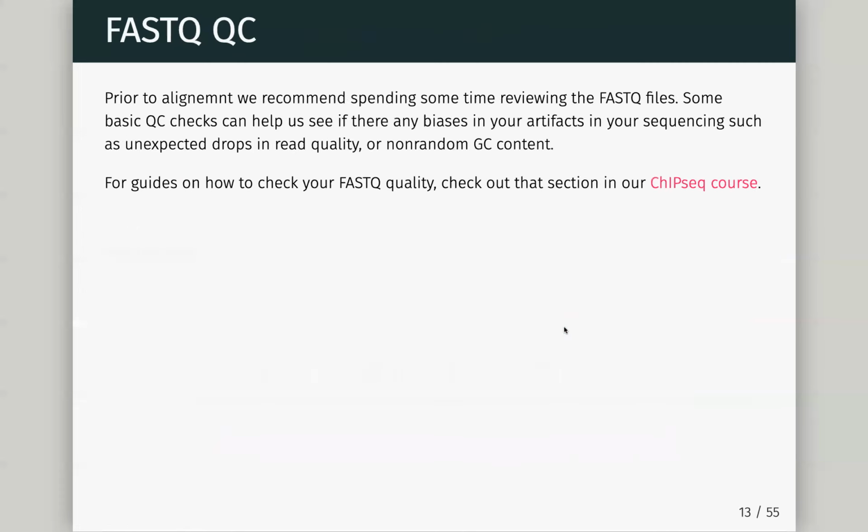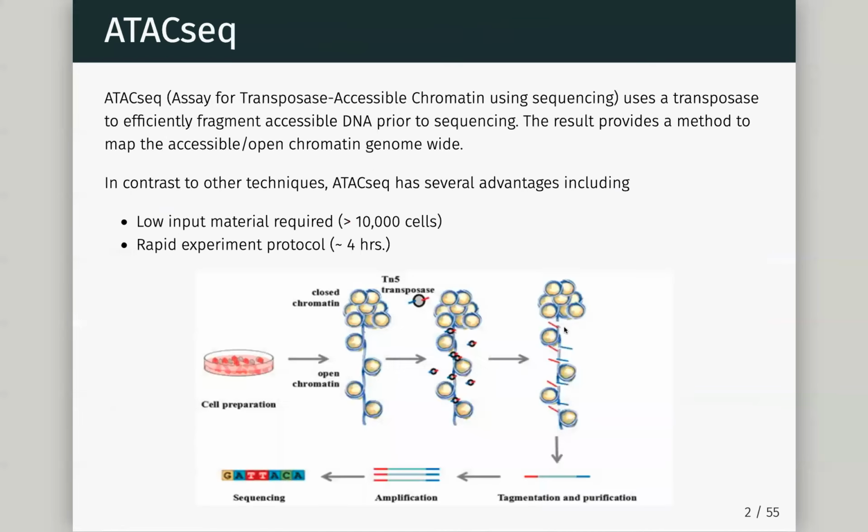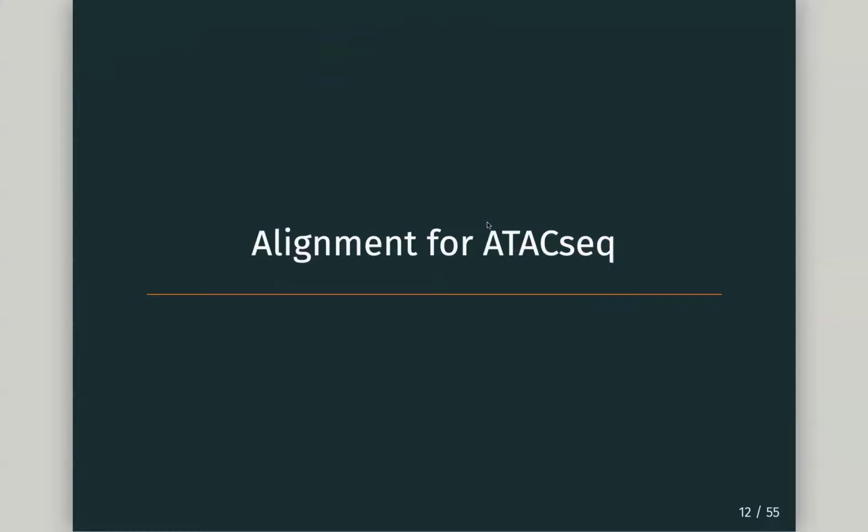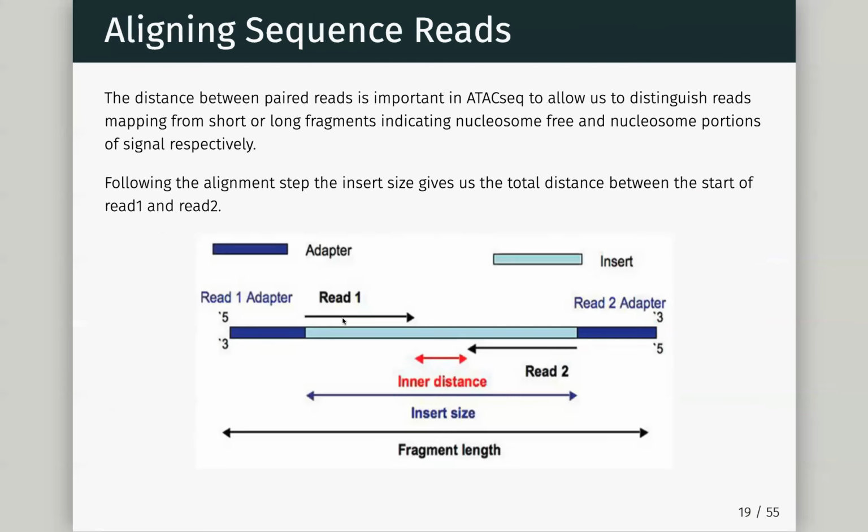So these are the broken up bits of DNA here. Those are what we're sequencing. Then we'll add the adapters, and read 1 will start from one side and read in. Then in the sequencing, we'll flip this and read from the other side, going backwards across the fragment with read 2. So you can imagine quite often read 1 and read 2 may overlap in the middle.